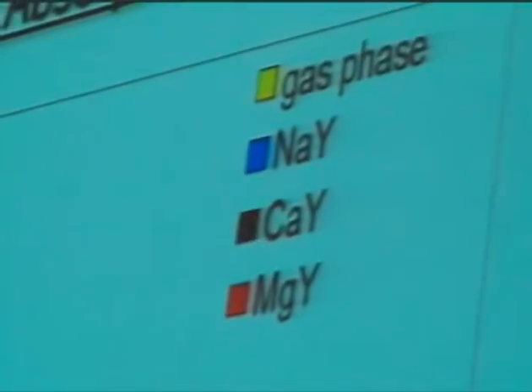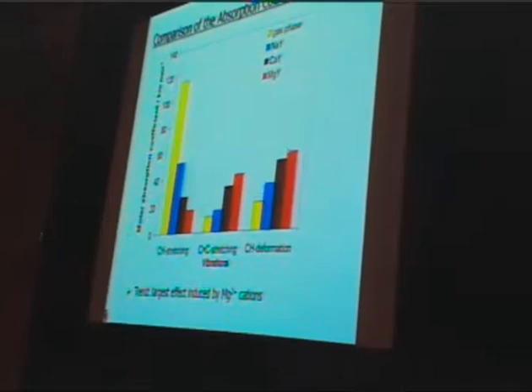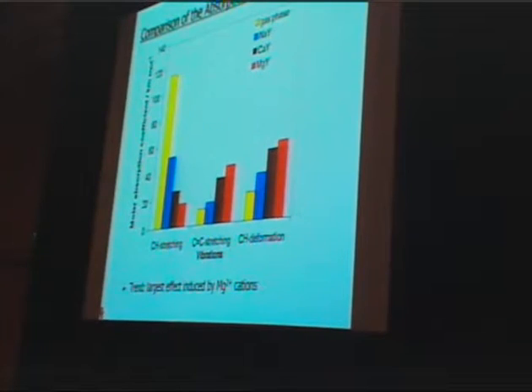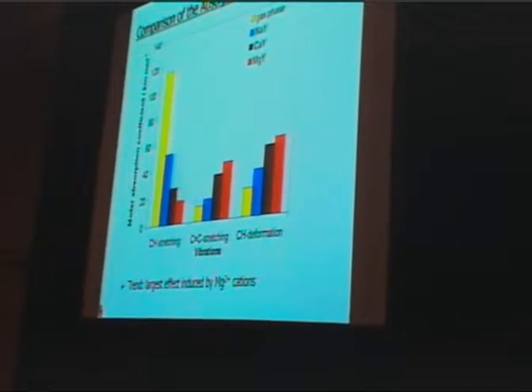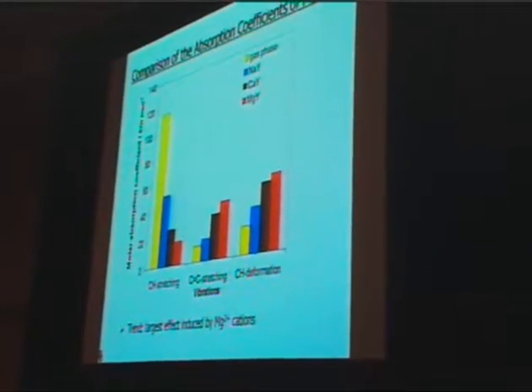so could not measure an absorption coefficient. I'd like to summarize the trends here in the vibrations of propene as it is adsorbed from the gas phase onto these three different zeolites. We see that we're losing intensity in this stretching regime. We do see that we gain in intensity in the CC stretching regime, and also the deformation increases. What this means we don't quite know yet. This is quite clear in our picture: increased intensity, increase in dynamic dipole moment, polarization of the bond, activation of the bond. And as expected, we have the largest effect here by the magnesium 2+ cations.